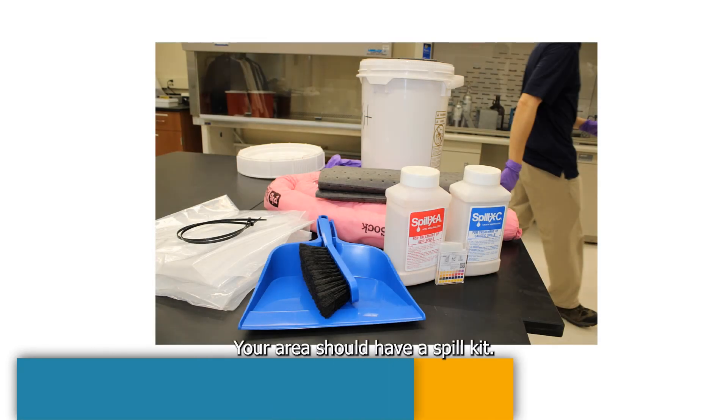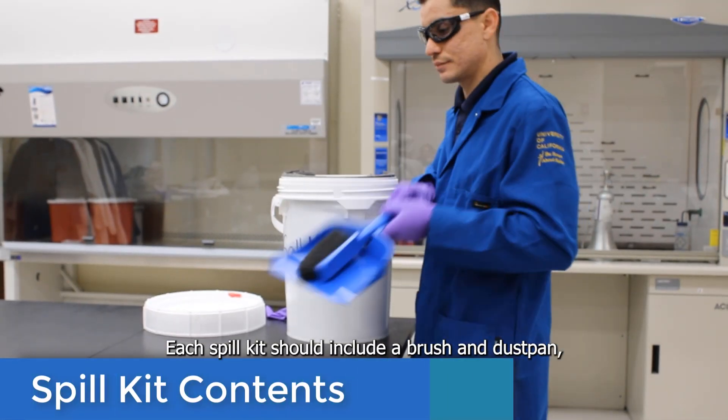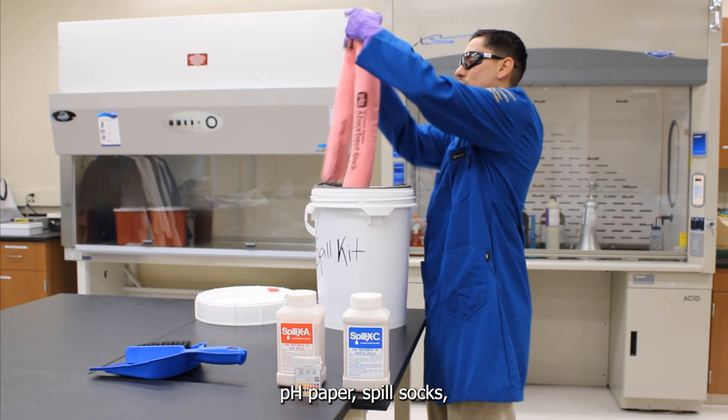Be prepared — your area should have a spill kit. Each spill kit should include a brush and dustpan, base neutralizer, acid neutralizer, pH paper, and spill socks.